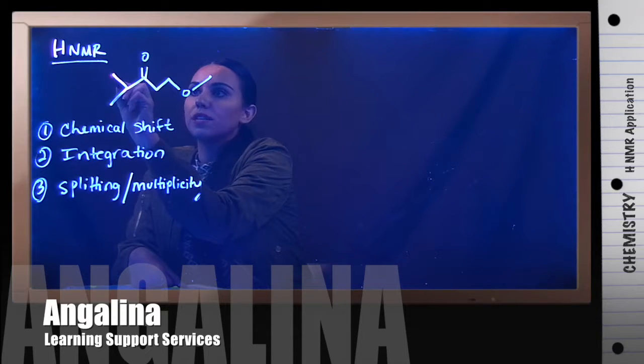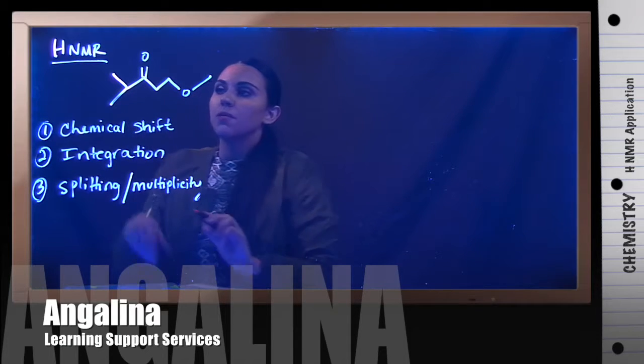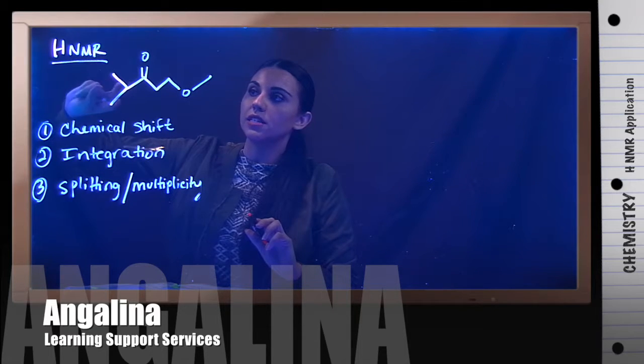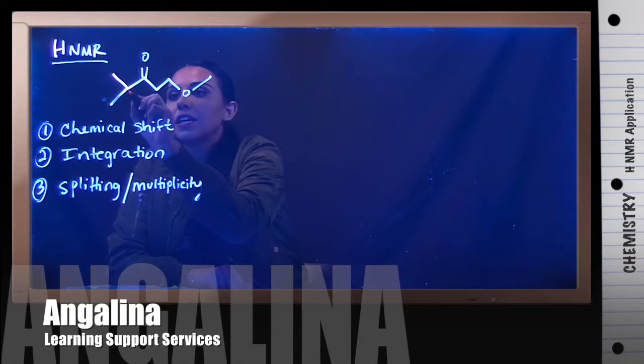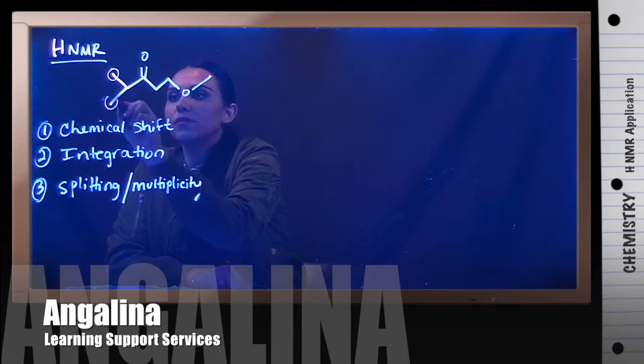So here's 3 hydrogens, so that's 1. Here's another 3, that's another. But then these two are going to be the same because single bonds have free rotation, so these bonds can rotate back and forth and they're going to have the same signal. Here we have 1 hydrogen, so that's another shift. So I'm just going to circle 1 shift.